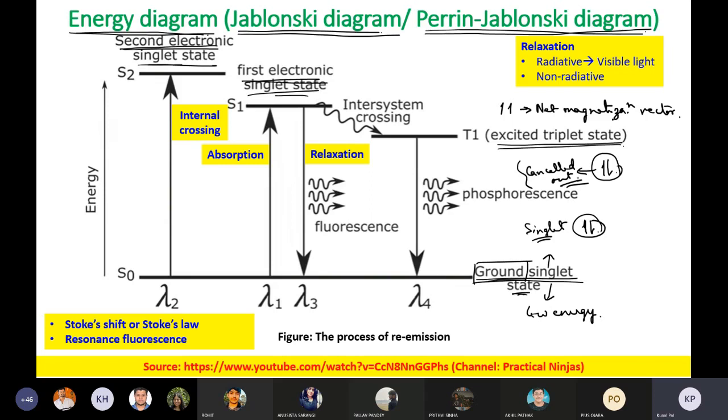Okay, there will be a net magnetization vector, and we all know that a magnetic vector is not present alone; it is also present with an electric vector or electric field. In the triplet state, the spins will be in the same direction, whereas in the singlet state, the spins are in opposite directions. Good.